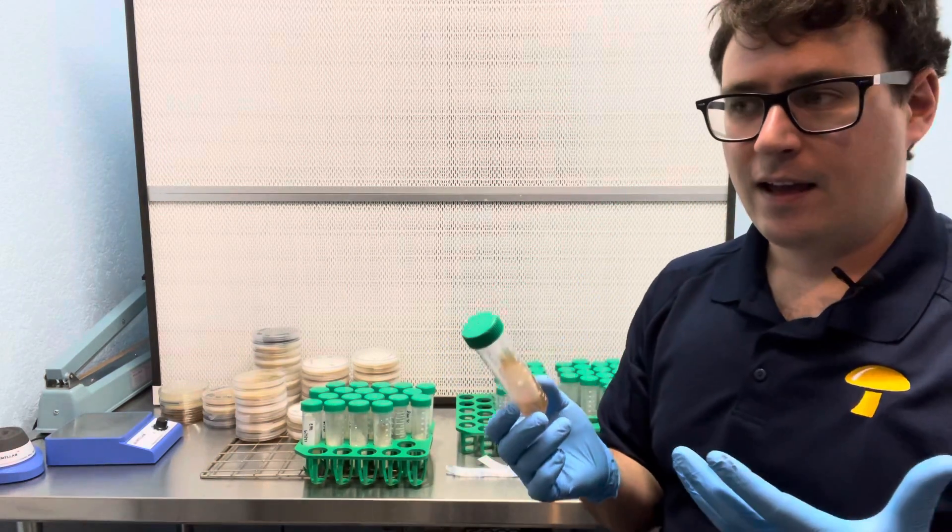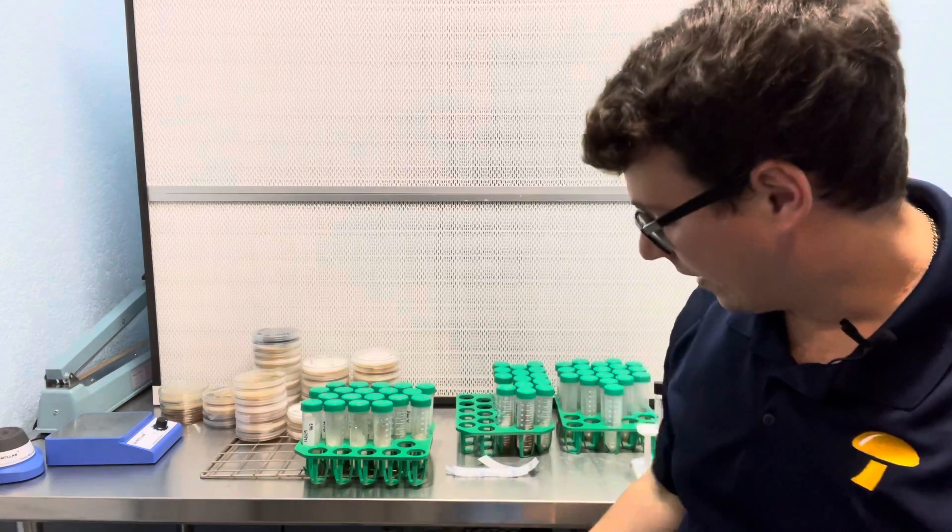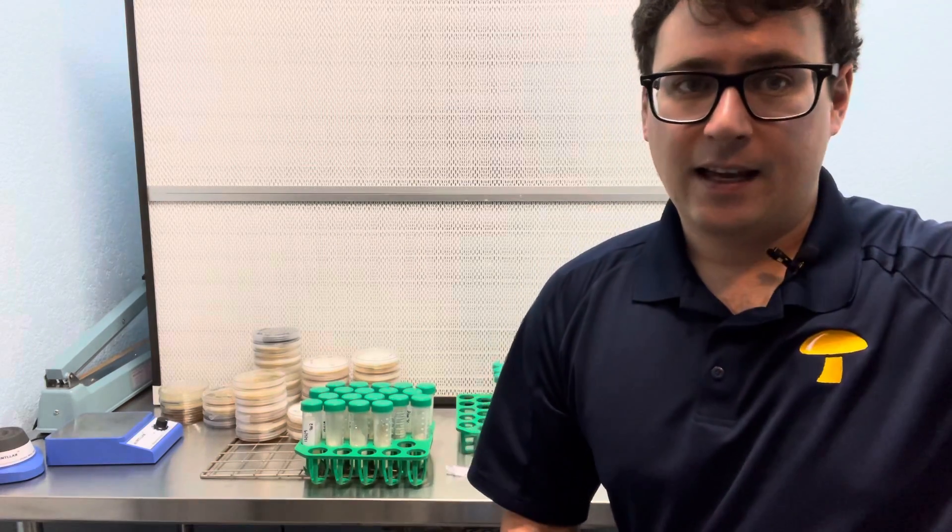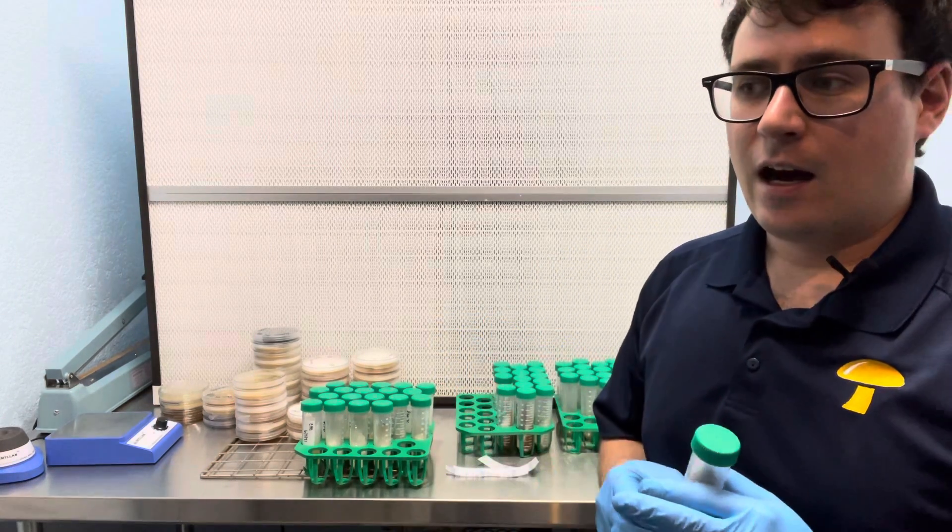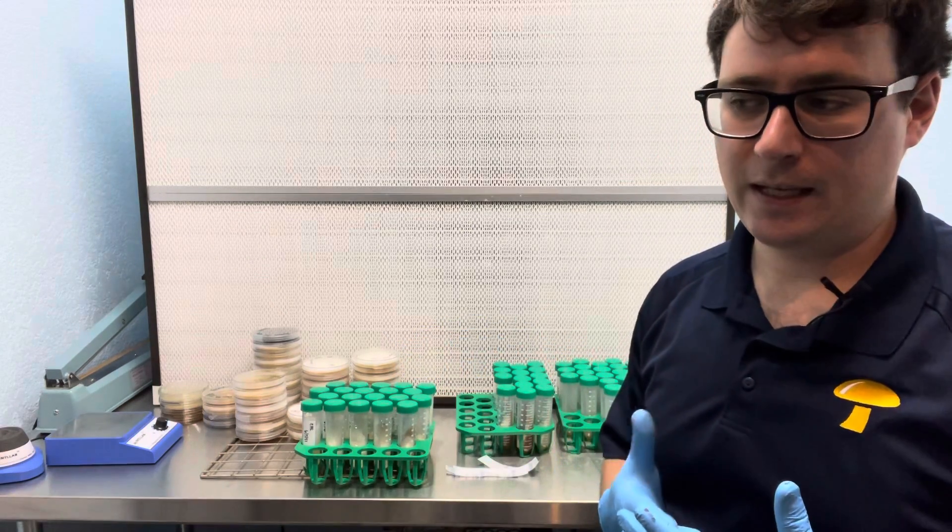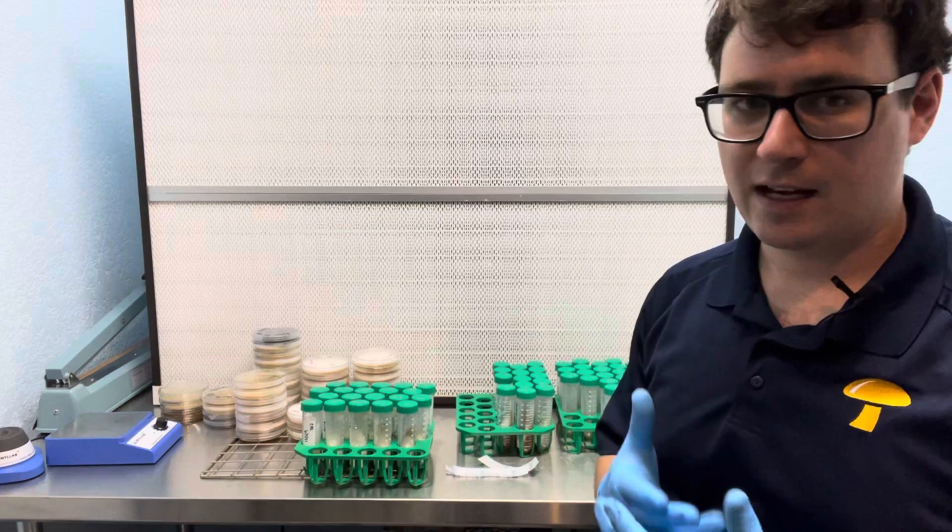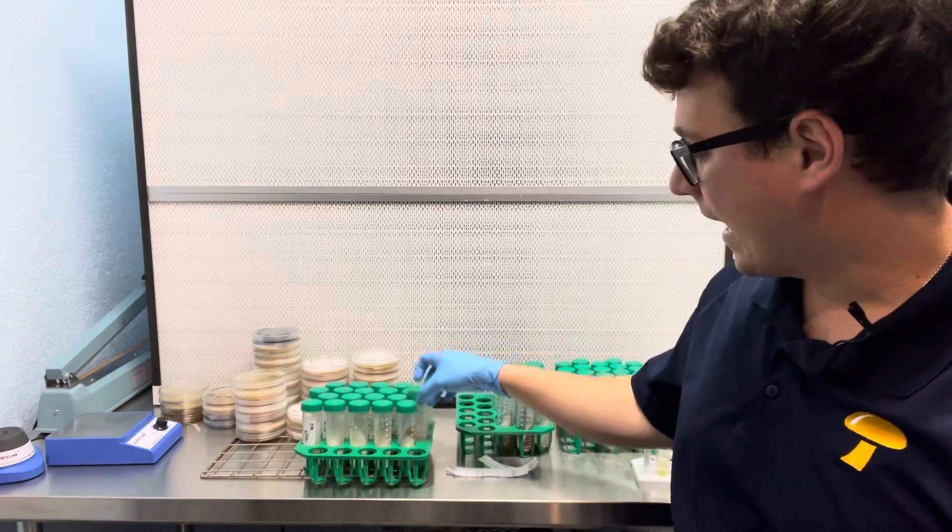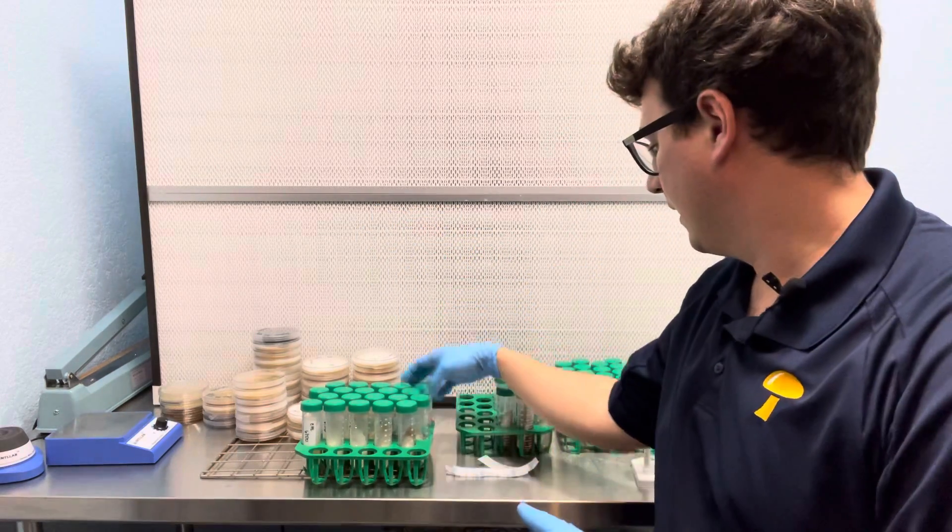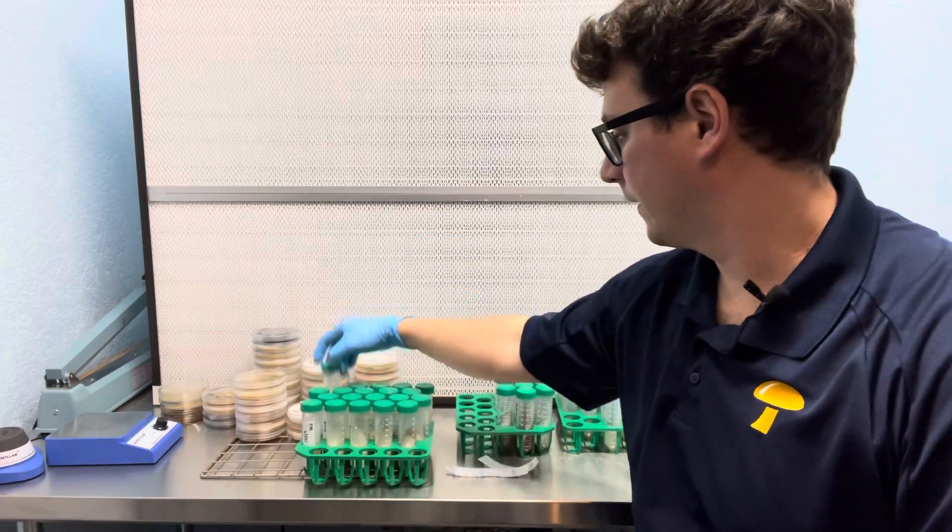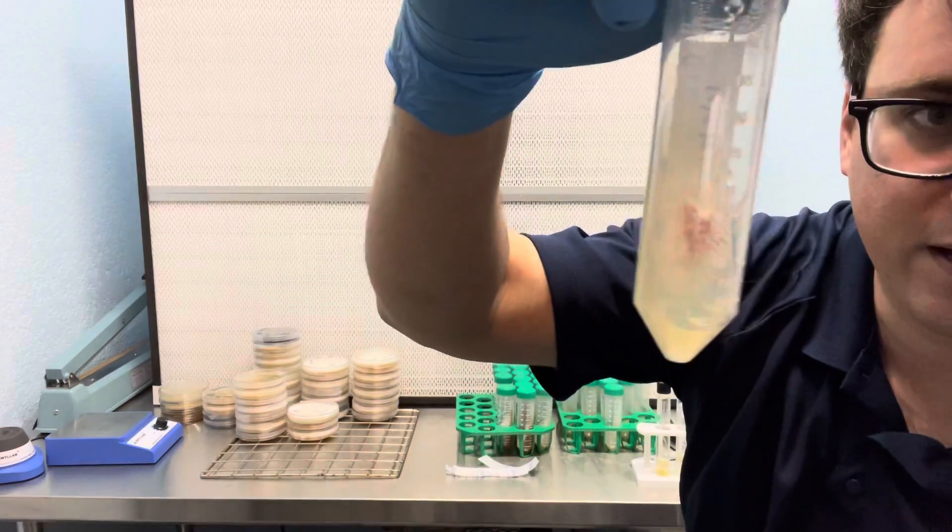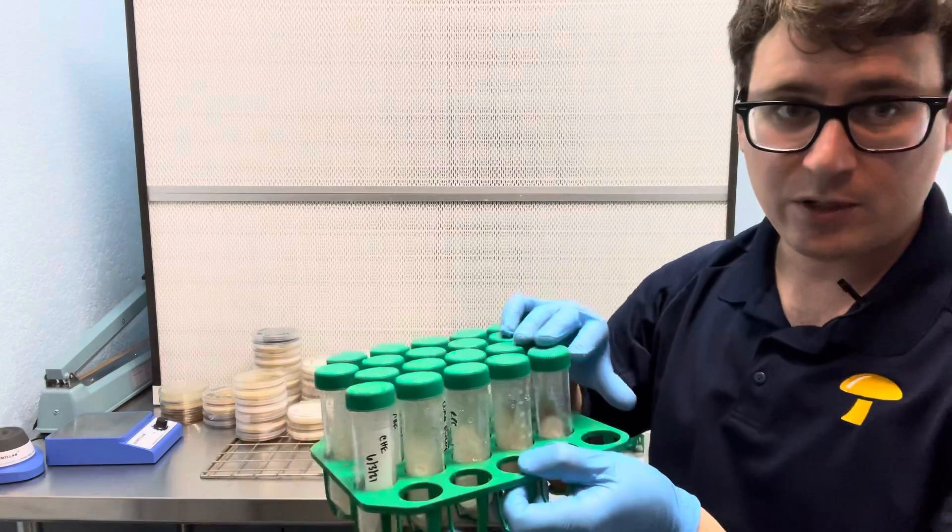So what I'm saying when I talk about long-term is just refrigeration. So I've got a refrigerator here that goes to about 40 degrees and then I've got my walk-in that goes between 37 and 40 but some people are wary about keeping more tropical species like a pink oyster or a golden oyster. So I keep them right, this is a golden oyster here. I believe I have some more, yep this is a golden oyster from June so they can survive temperatures in the 40s.